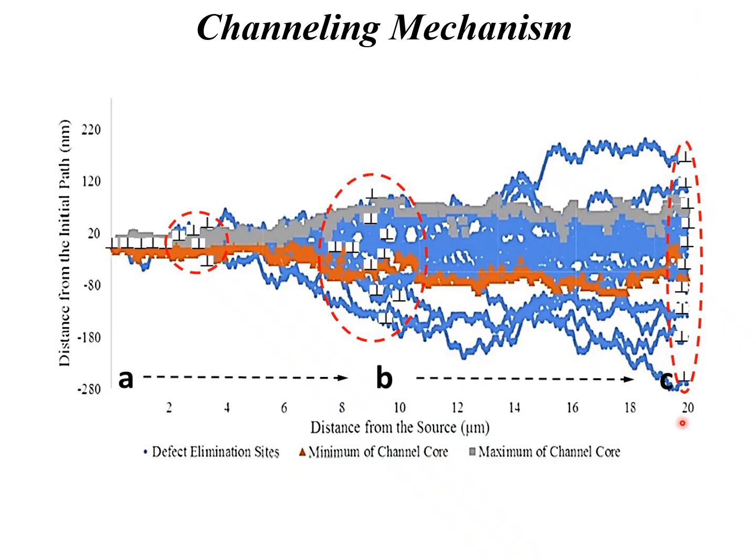So let's say that they butt up against a boundary or some barrier. You end up with this kind of structure. Now, the characteristic of dislocations that are arranged like this is that essentially it's a tilt boundary, and there's a tilt in the crystal as a result. There's no tilt from the shear of individual dislocations on one slip plane, but when the dislocations exhibit climb, it is climb that gives this tilt property to the dislocations in the crystal.